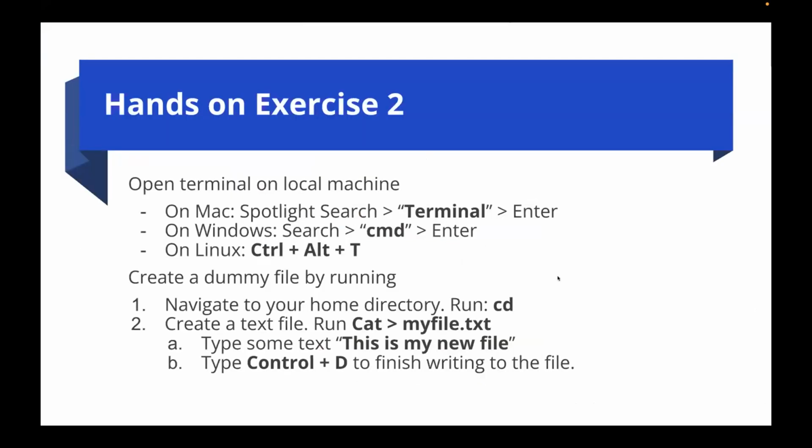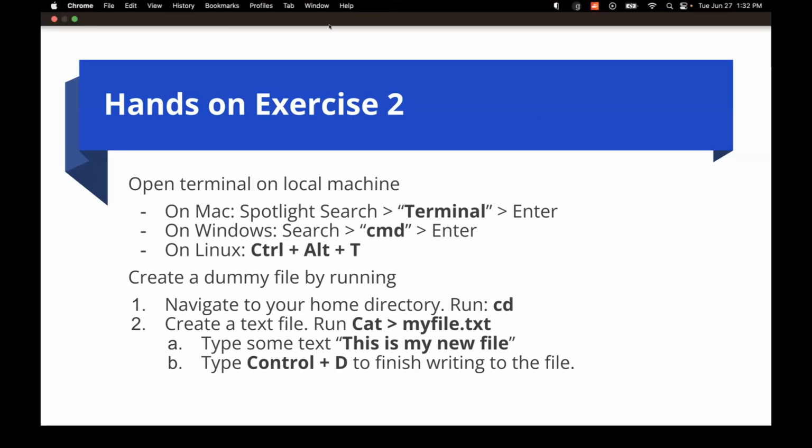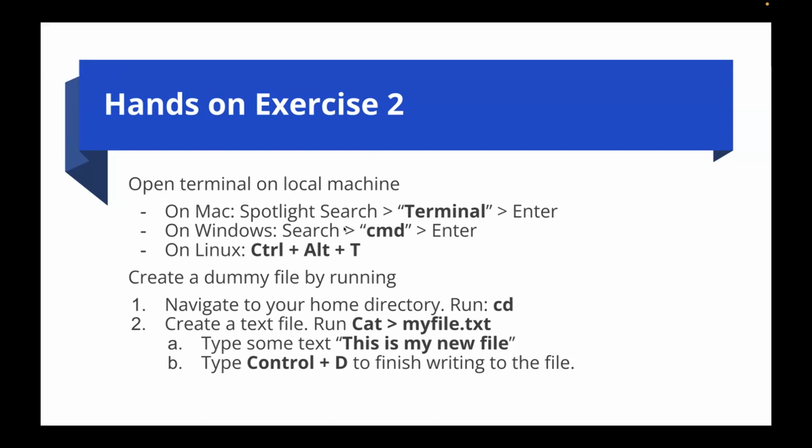I'm going to show an example of actually creating a file and uploading that to our directory we created. So we're just going to create a dummy text file. You can do this any way you wish. I'm going to show an example just doing it in terminal just quickly. You can make a text file on a notepad if you want to. Anyway, doesn't matter. So I'll switch over here and just show me doing that and pointing an upload to my data directory.